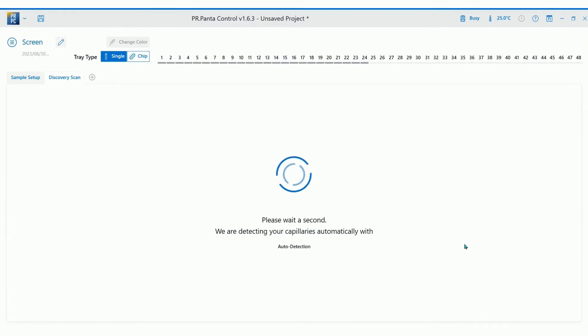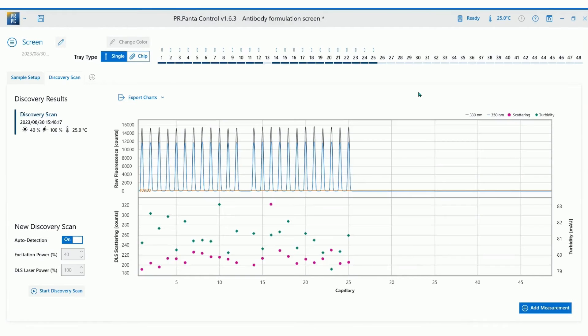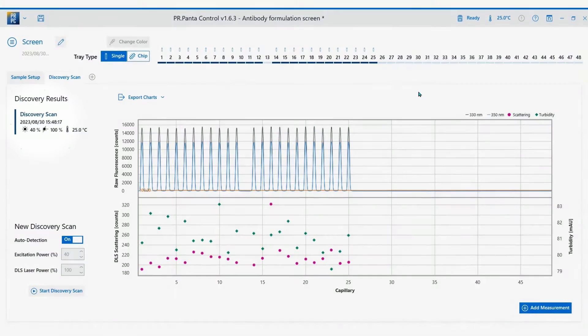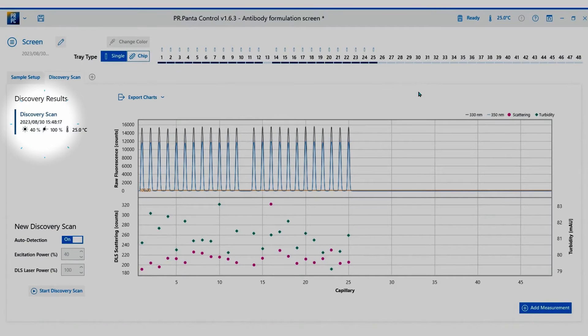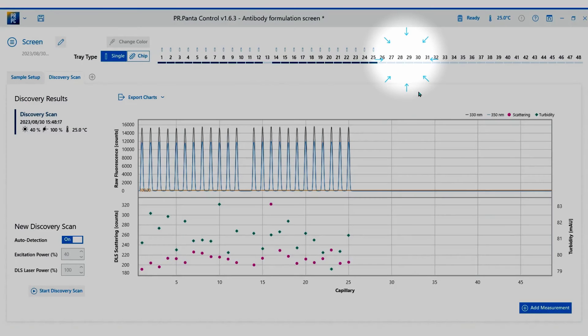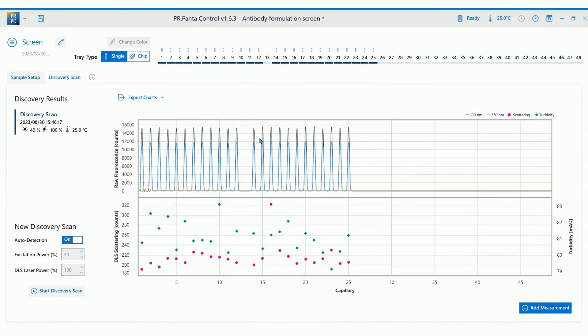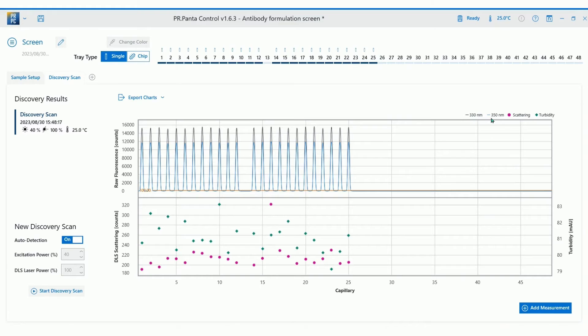The software will perform a discovery scan of your samples to determine the best excitation power for experiment and identify empty capillary slots. Each capillary is visible as a combination of two peaks. They represent the fluorescence intensity at 330 and 350 nanometers respectively.